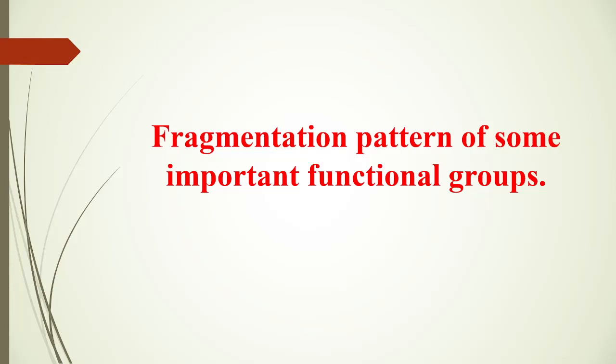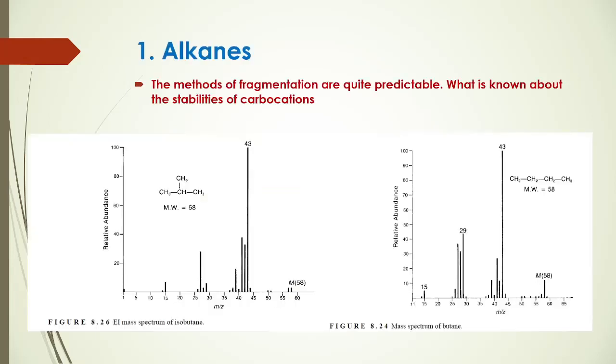Each and every functional group has a fixed fragmentation pattern, which will help us to recognize the fragments which are removed from that molecule. So friends, without wasting time, let's begin with our first functional group, that is alkanes.